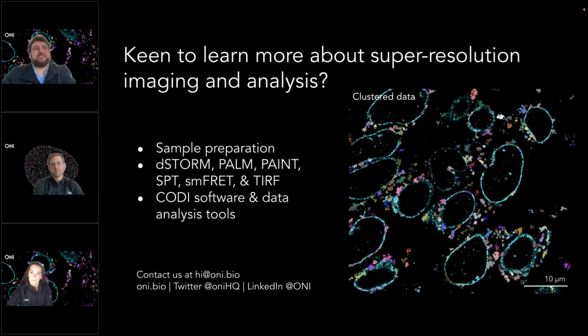Other parts of CODI: the part that you see is web-based, so that's in JavaScript. And then the cloud itself runs in a language called Go, and that ensures robustness and means that CODI won't crash when hundreds or thousands of people log on all at the same time. I suspect those latter two are maybe a bit more detailed than you'd like, but Python is the main analysis language. Okay, great. Thanks for that, Marcus.